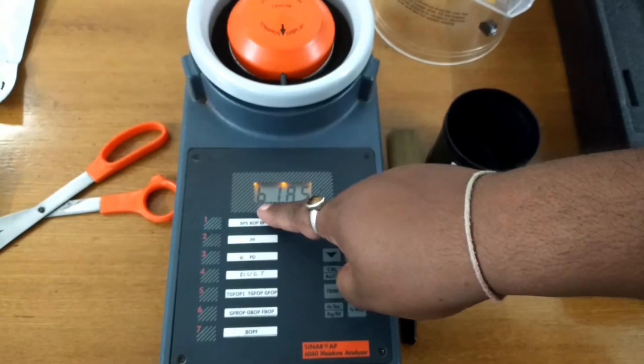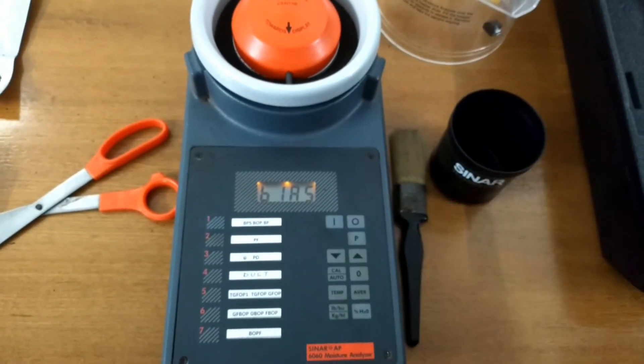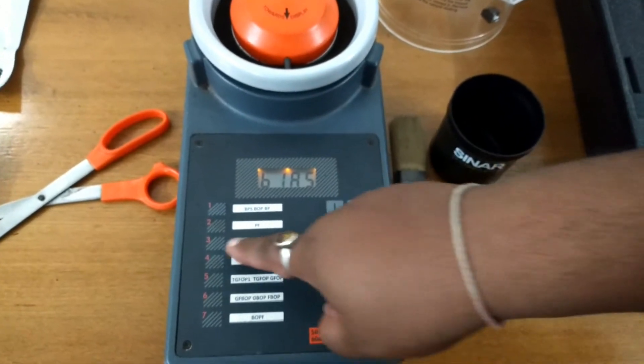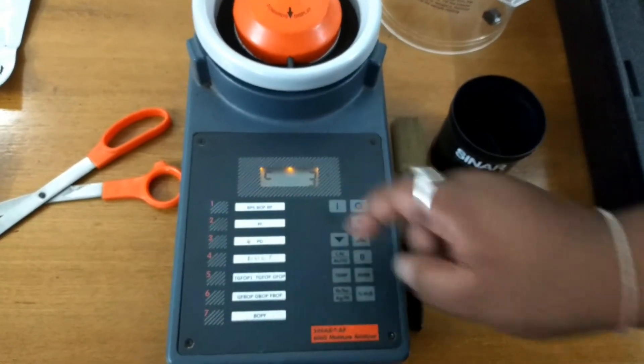The display shows BIAS. Now, with this display, press channel number 3 and press H2O.